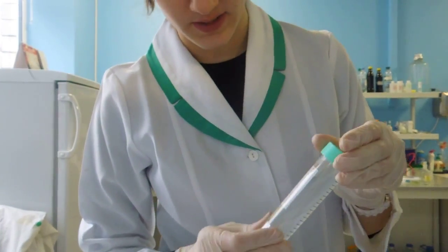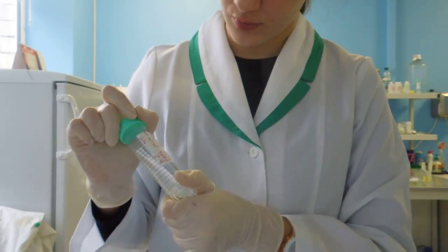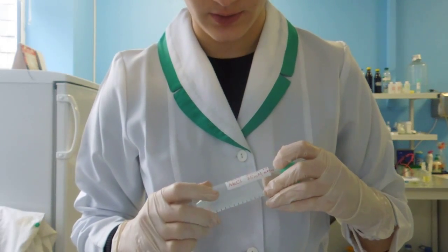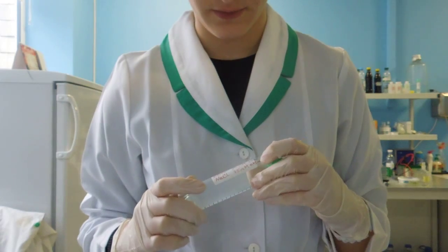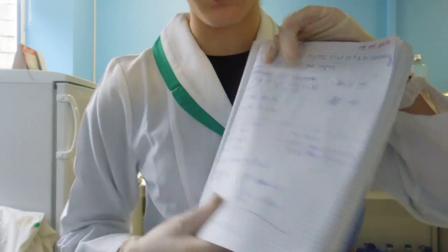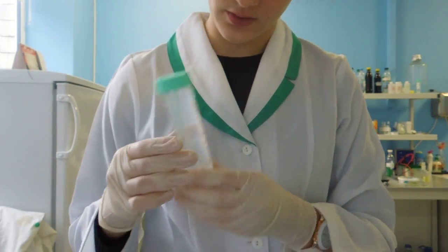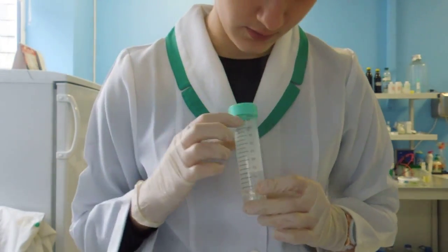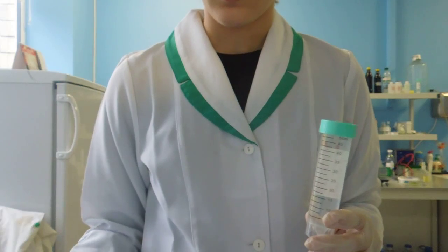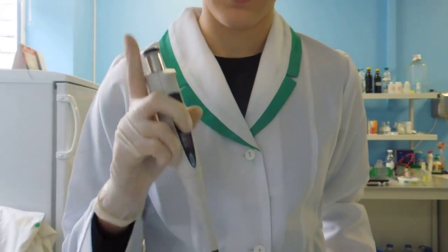Greetings, everybody. Just made a lysis buffer, and the proportions are written here. You need EDTA, 2.5 milliliters — the calculations are noted here to make sure it's written correctly. This is for a total quantity of 50 milliliters. After adding 2.5 milliliters, which worked out as 500 microliters, I added it five times.